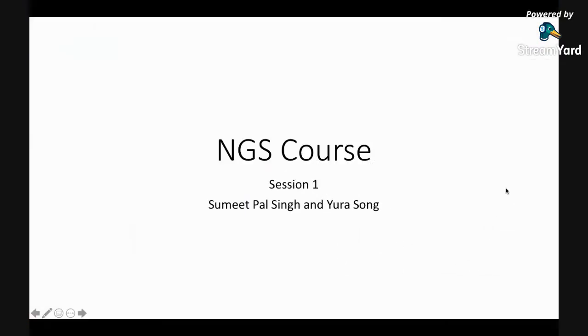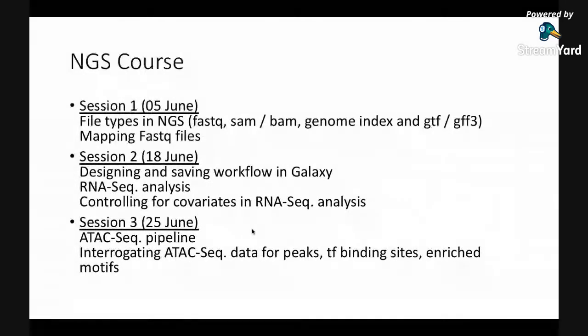So, welcome again to this new course on next generation sequence analysis. It will be conducted by Yura Song and myself, and the course will be divided into 3 sessions as of now. Today we will just talk on introduction, so on the different file types in next generation sequencing, and on how to do some kind of mapping.